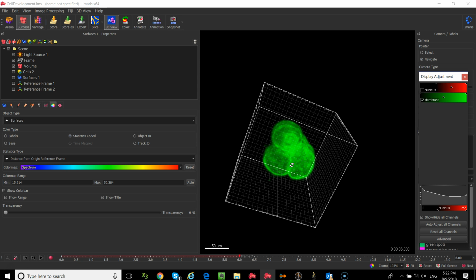So what we would do is we'd find the nucleus, that would be the center, and then we'd fill the cell until we hit membrane. But in a live cell situation, nobody wants to mark the nucleus. They just want to mark the cell boundary, and they don't want to have to deal with lots of different labels or markers. So we now do membrane detection with or without a nucleus.